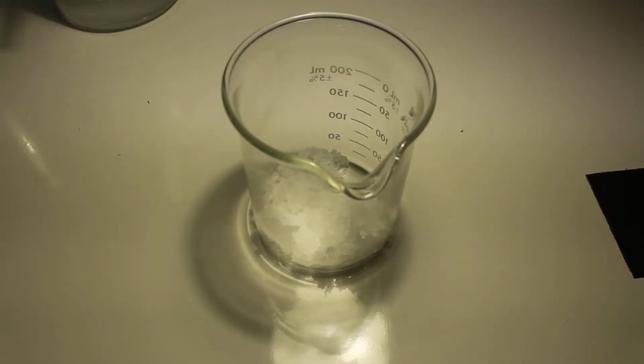The crystals are still wet, even after a week of drying, mostly because the coffee filter crystallized and prevented the water from going through it. Some water still got into the basin, but that water is also saturated with crystals, which we're going to need to get out of that as well. The only option I have left is to set up a dryer.